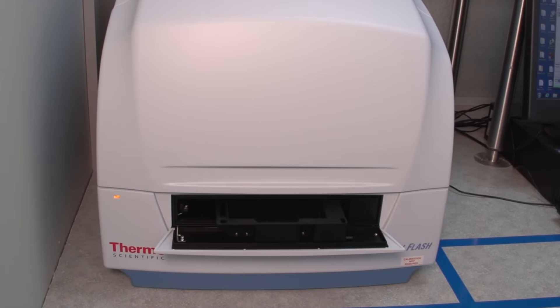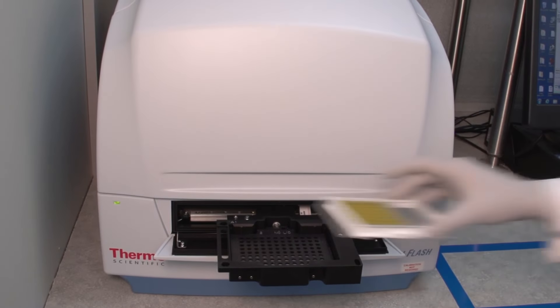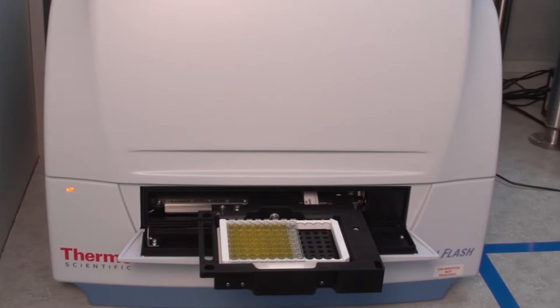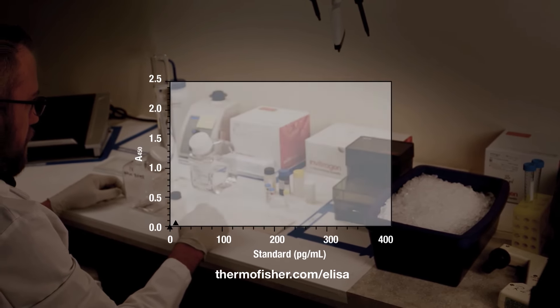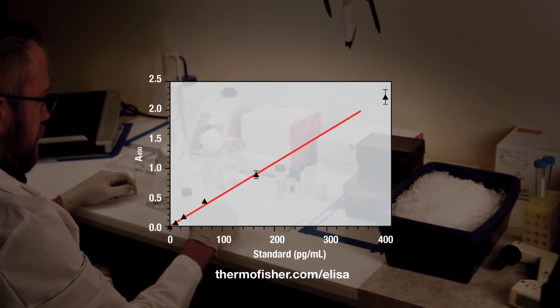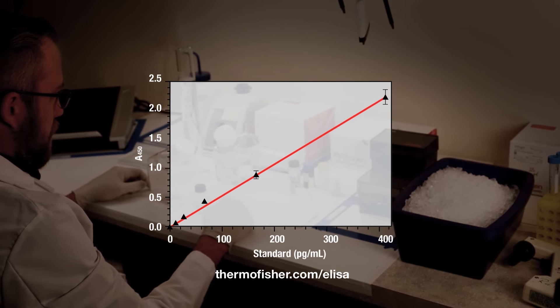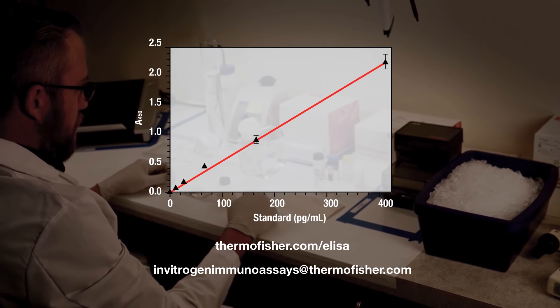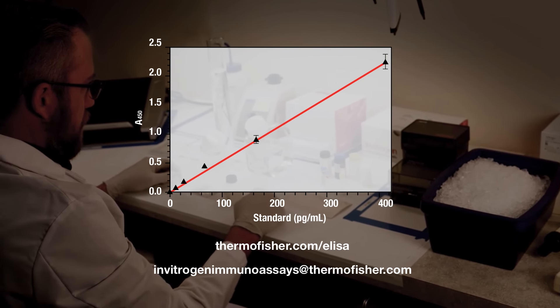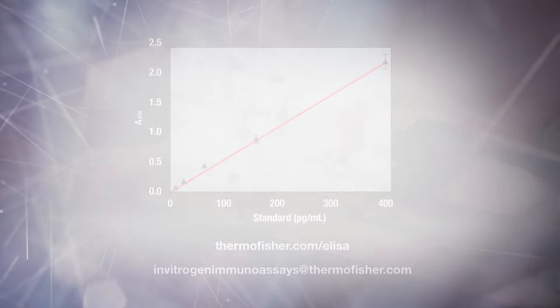Measure the absorbance at 450 nanometers using an appropriate plate reader. Congratulations, you are now done with your ELISA. For more product information, go to the link on the screen. Or for technical questions, email our technical services team at invitrogenimmunoassays@thermofisher.com.